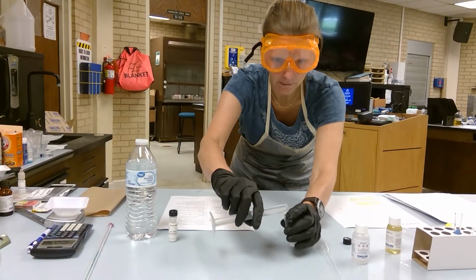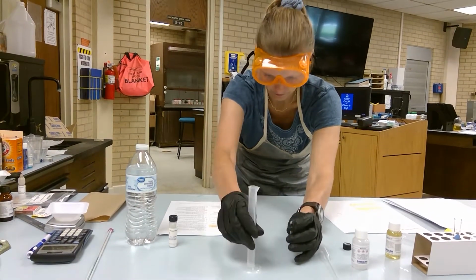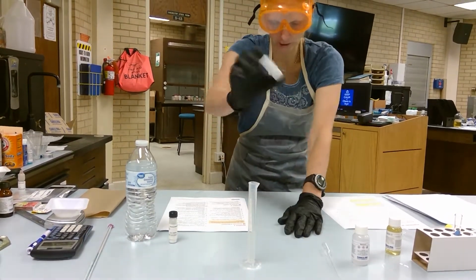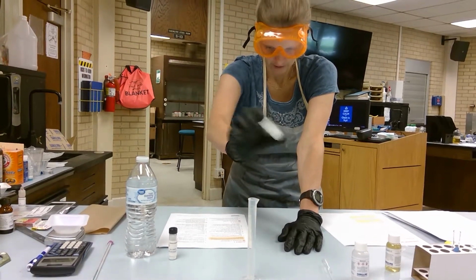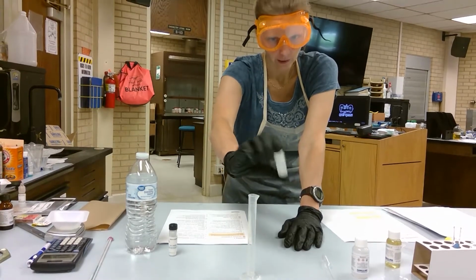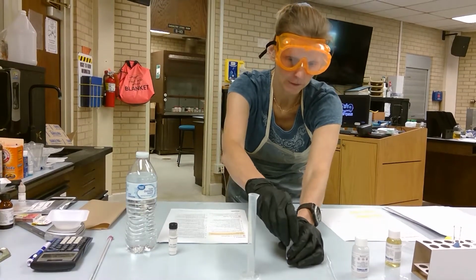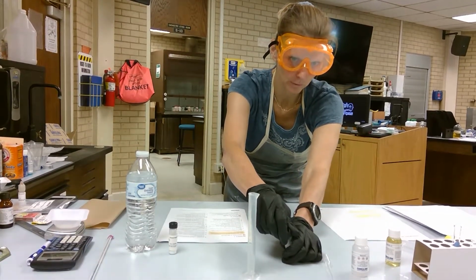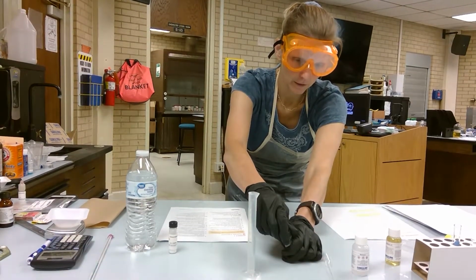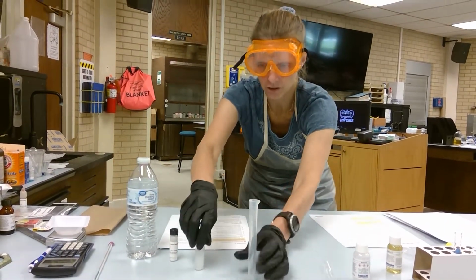Okay, so to set this up for my 48-hour process, I'm going to go ahead and add my 8 mL directly to my vial. Okay, and I'm going to cap it and shake vigorously. Now remember, you're working with an alcohol here, which means it's volatile. And what do we know about items that are volatile? They tend to build up pressure. So make sure that when you take the cap off, you don't do it directly near your face. Okay, I release the pressure.